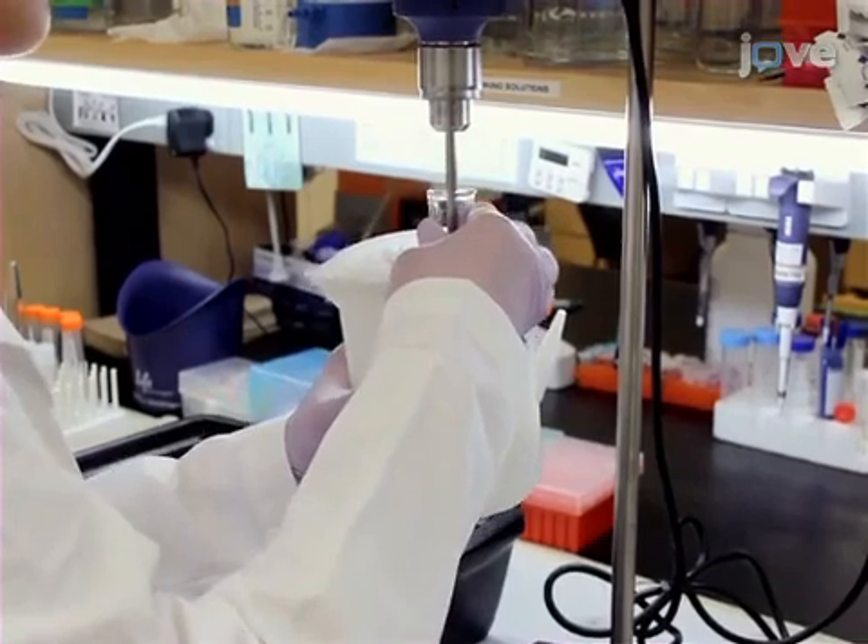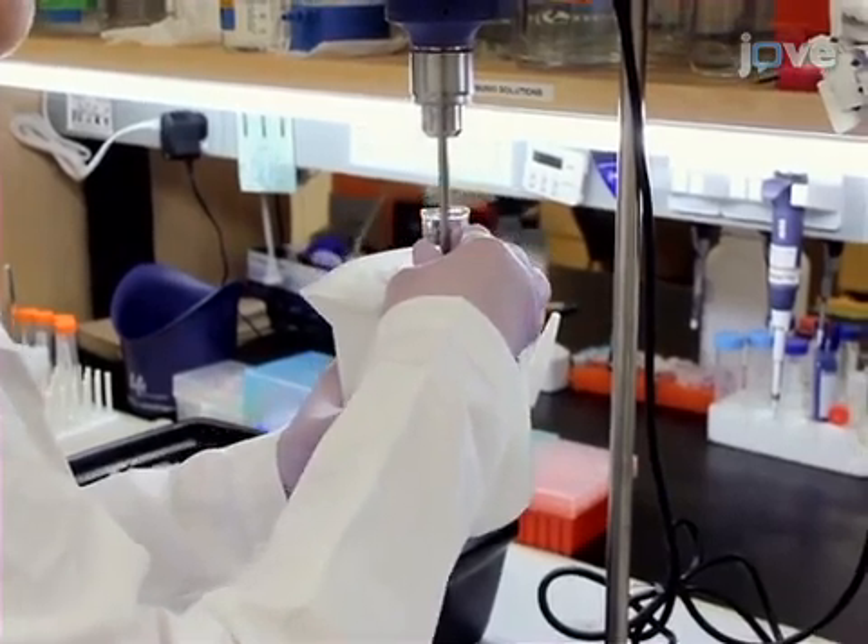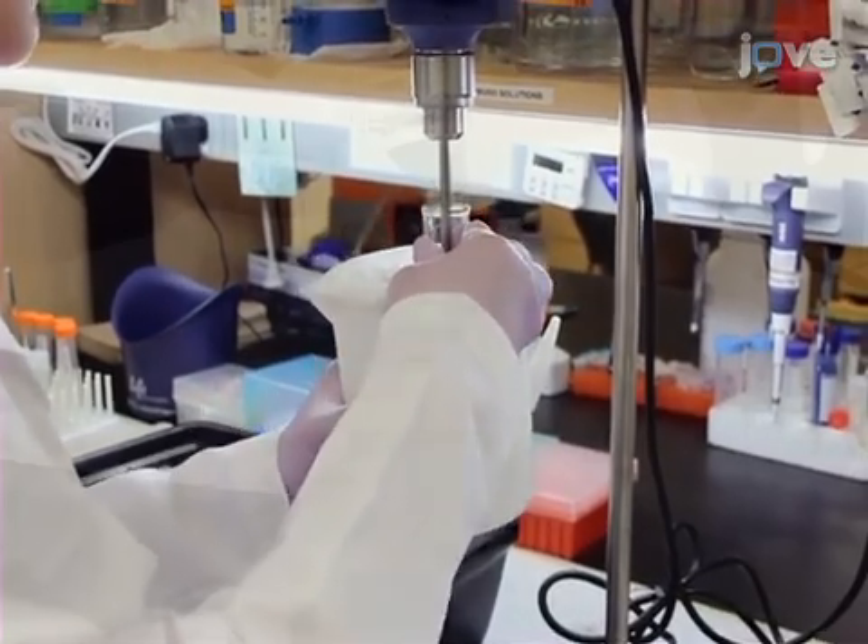Using less than 4 grams of tissue ensures a good fractionation. Transfer the sample back to the tube and store the sample.